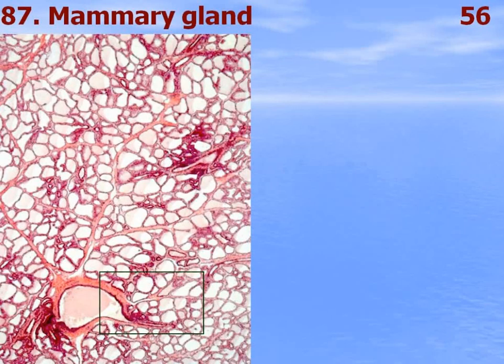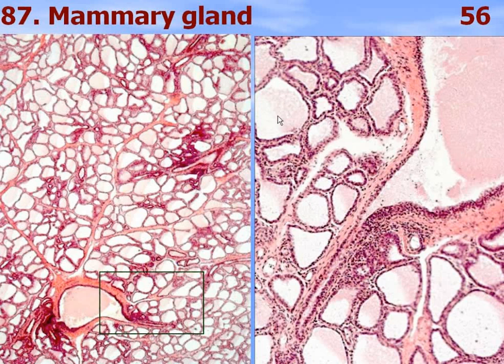Mammary gland — it is a parenchymal organ consisting of a capsule and loose connective tissue septa dividing the organ into lobules. The secretory portions are alveoli lined by simple columnar epithelium. Intralobular and interlobular ducts are lined by cuboidal stratified or stratified epithelium. Lactiferous ducts contain milk inside. Blood vessels are also visible.